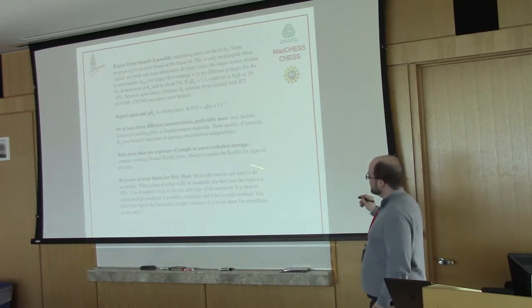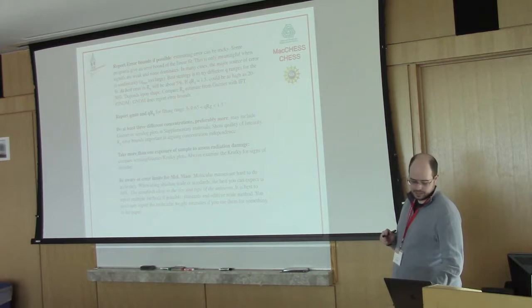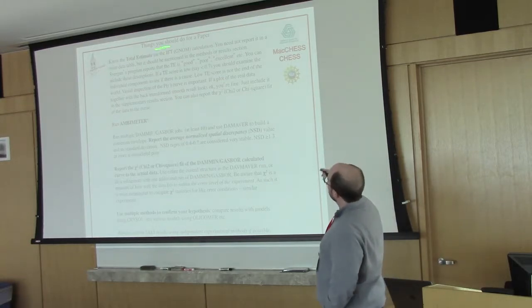And then we've talked about estimating uncertainty and molecular weight. Make sure you're accurately understanding the limits of that analysis in SAXS. So there's more, the total estimate.